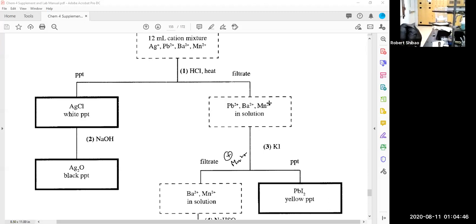Okay, I got a precipitate here. This dropper is not working so great, so let me get a pipette. I got a lot of precipitate. Oops, you guys can't see that. I got to make sure I precipitate out everything like I just did. We got to make sure we get all the silver out. Or this may be lead. I have a feeling this is the same. Hopefully unknown B is not the same thing as unknown A. That would not be very interesting.